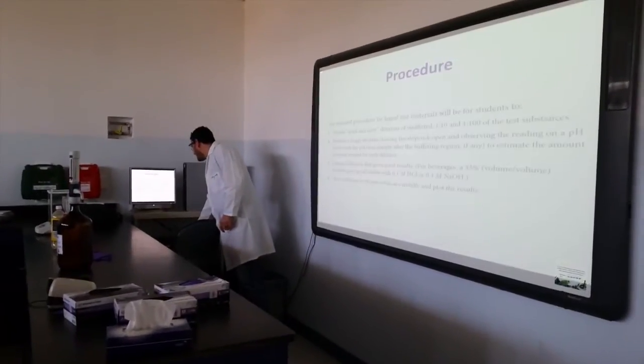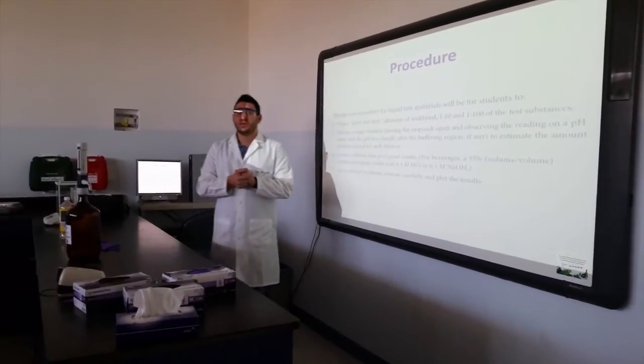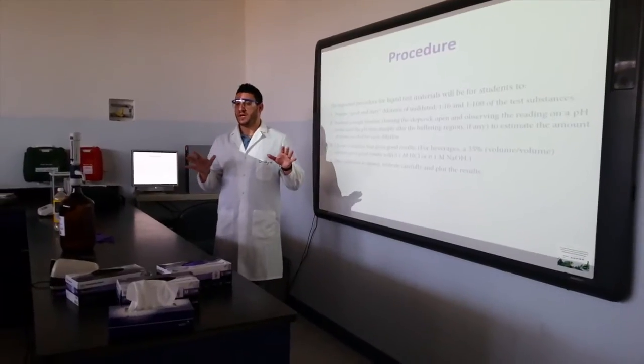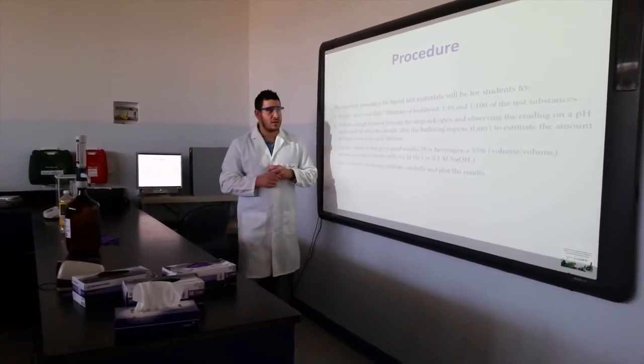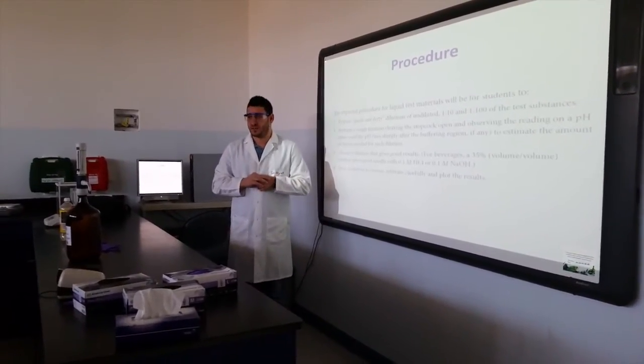Now in terms of procedure, as I said, it's not going to be different from any titration you have done before using a pH probe, and especially last week's experiment. The only thing that you have to watch for is the dilution factor that you are going to use.